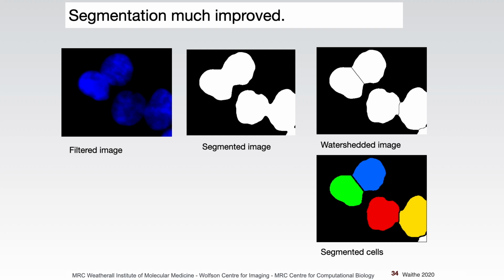So actually, to say they're high frequency isn't really right, but they're the higher frequencies than this low frequency component that we managed to extract using this heavy Gaussian blurring. And because it was the lower frequencies that were disrupting the segmentation process, by extracting them using this, we managed to get a much cleaner result, which was useful to us.